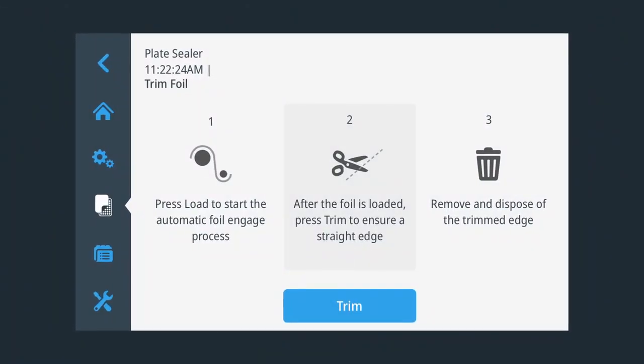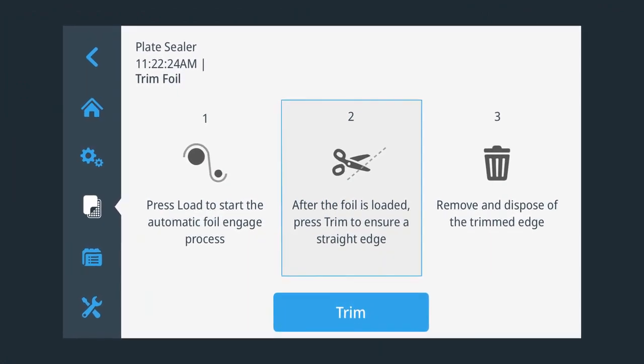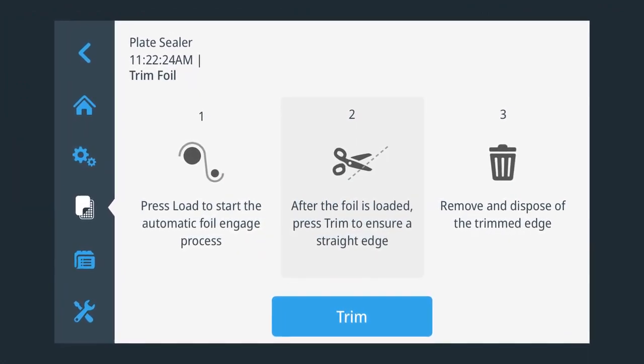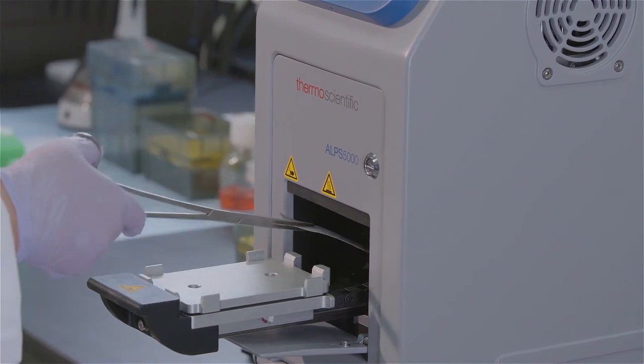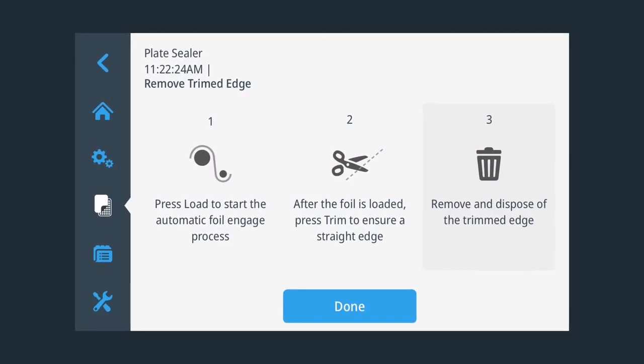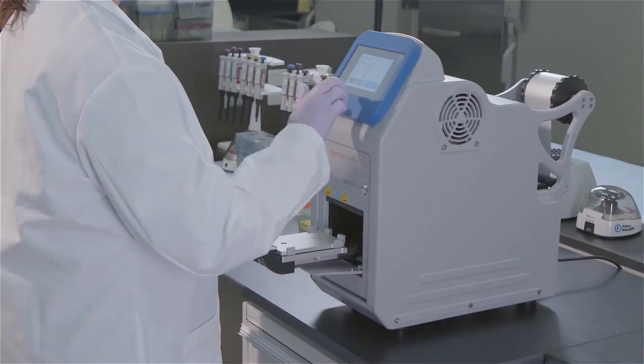Tap trim on the touch screen. Once the unit has trimmed the foil, use the provided tongs to remove any excess. Tap done on the touch screen. The unit is now ready for use.